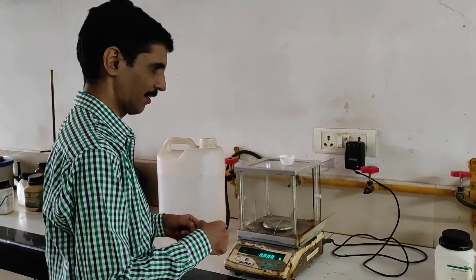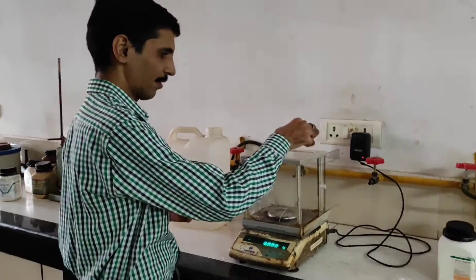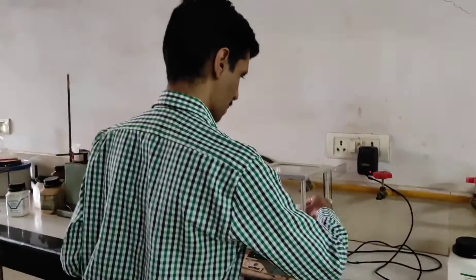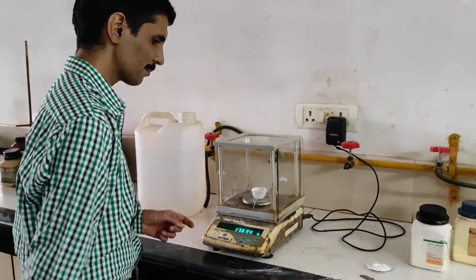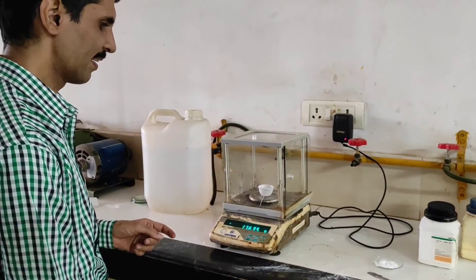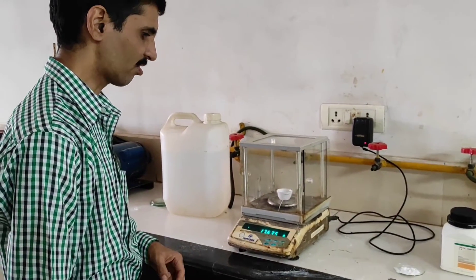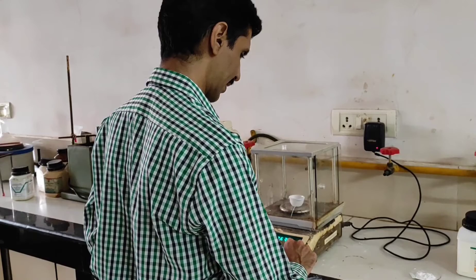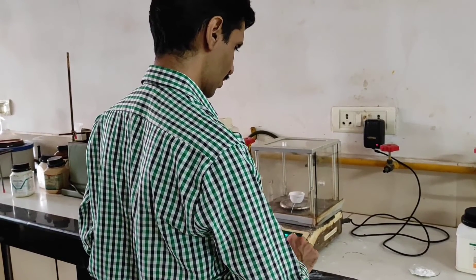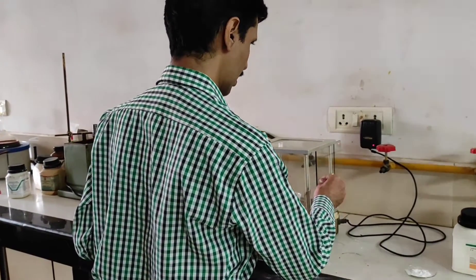So you can see the indicator is 0.0. So we first take the weight of the empty crucible. So the crucible weight is 17.635. Now I press the button tare, so it will show 0.0.